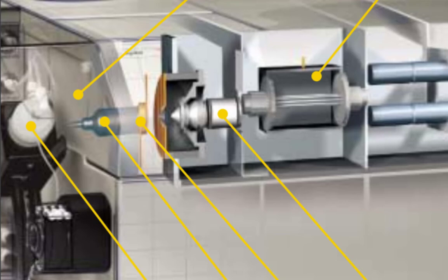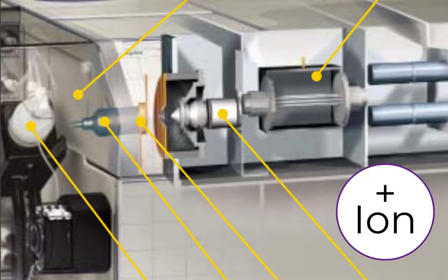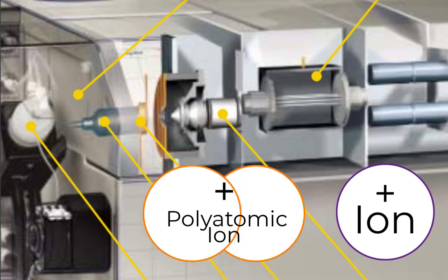So once the sample has entered the plasma, it should be fully ionized. Now that is the ideal case. So what we actually have after the sample enters the plasma is monoatomic ions, which would be the ideal things that we're measuring because we only want to know the mass of the individual ions. We'll have polyatomic ions, also known as interferences, which might be measured as an incorrect mass. So this might give you erroneous data.